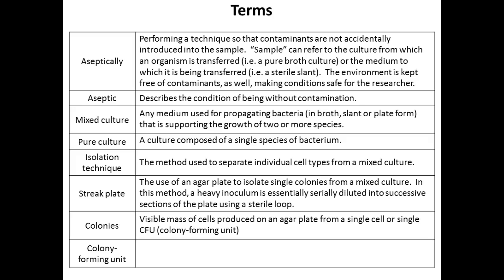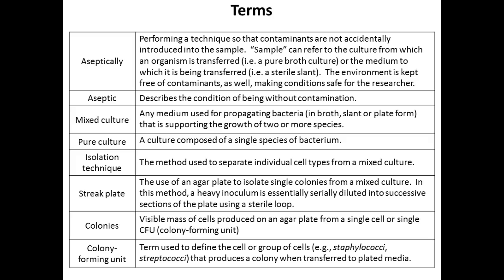Now, if that growth is from a single cell or a cell from the same species, we refer to those as colony-forming units, abbreviated CFU. And later on, we'll even count these.